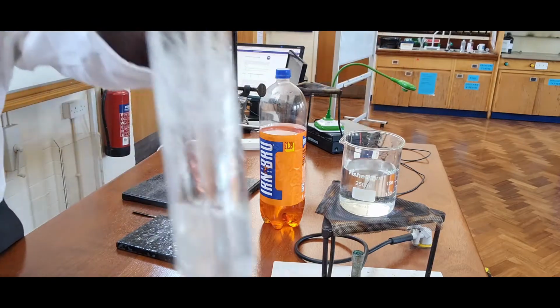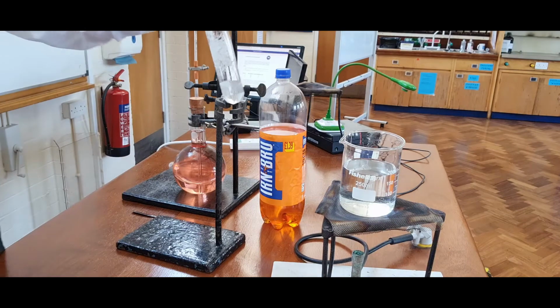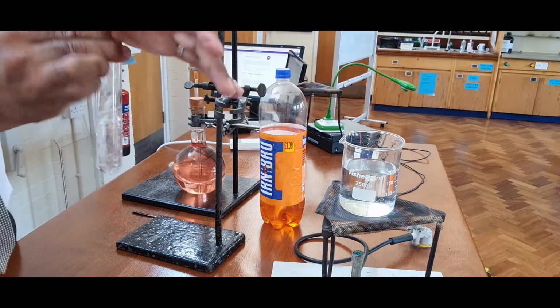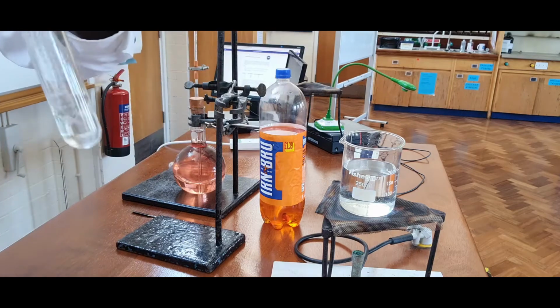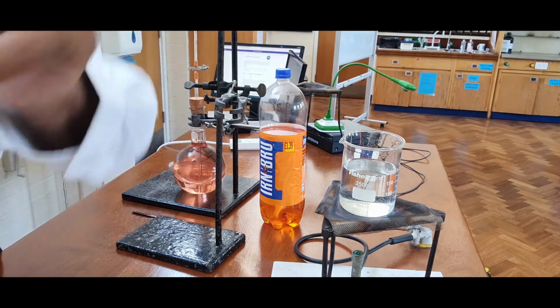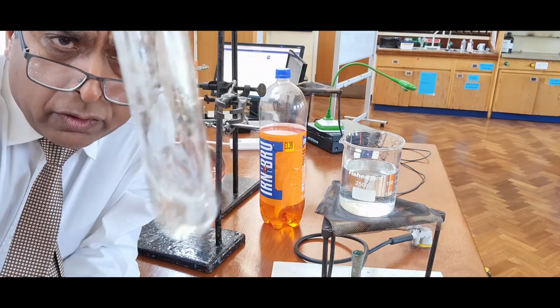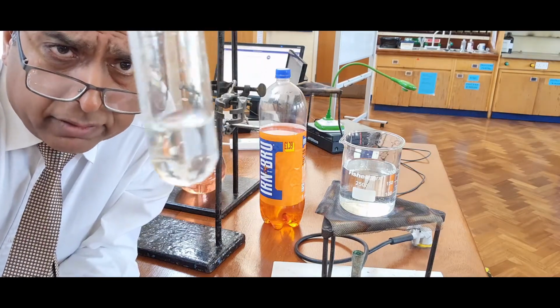See? It's dissolving. There's some ammonium chloride towards the top end, so I'm just going to try and get that in. Can you see? There, I think the ammonium chloride has all dissolved.